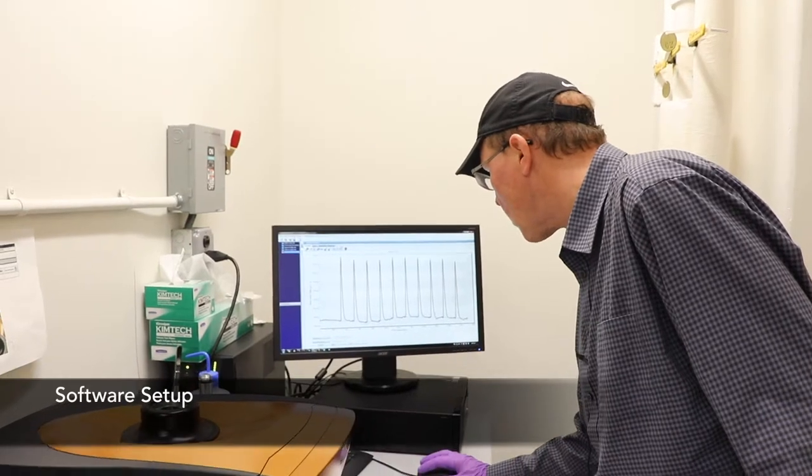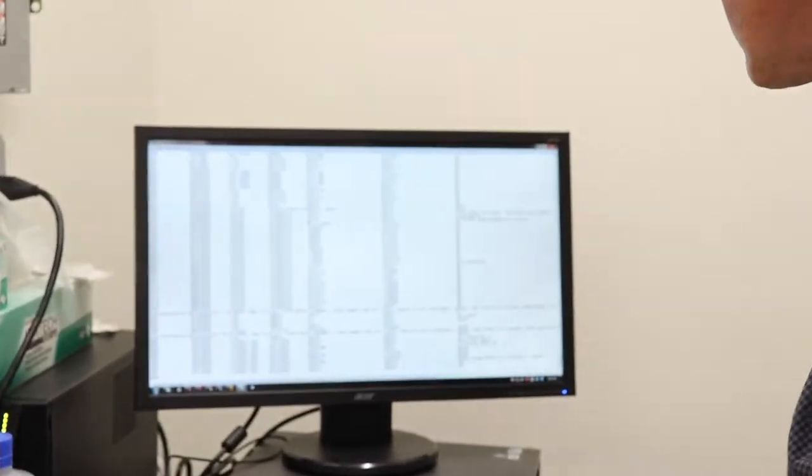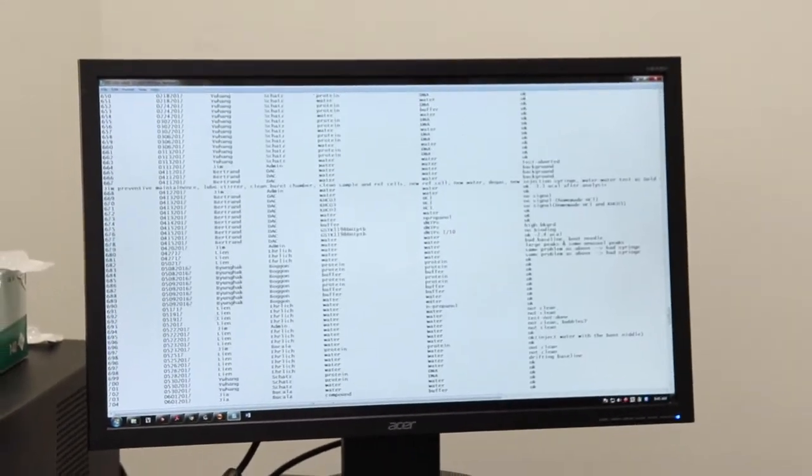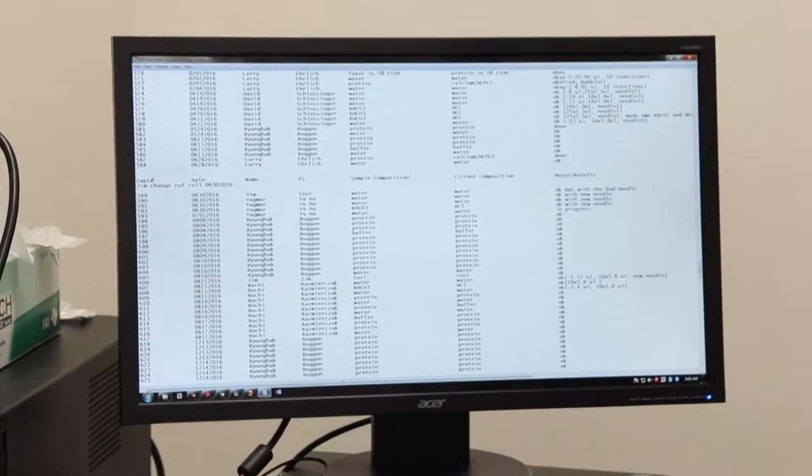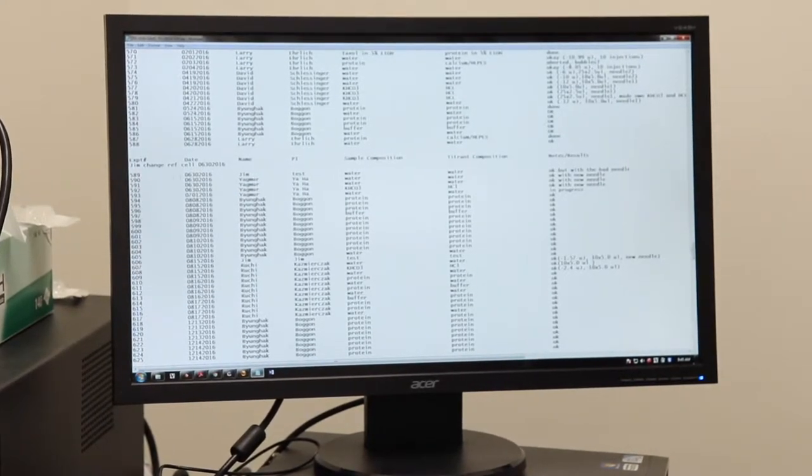One important thing is a notepad document here, where for every injection that we do, you want to do experiment number, just add another number to that. Please use the tab key in between each one of these because I import this into Excel. The date, your name, your PI, your sample and titrant composition. For the most part, protein or peptide is pretty good. The only time you want to be more specific is if you have a really volatile compound such as DMSO or something exotic that you put in there. And then at the end, you'll put notes. Mostly I'm concerned about your notes if it didn't work or your final one where you cleaned it and did water to water and then you show it's okay. For your own experiments, you can write whatever you want here.